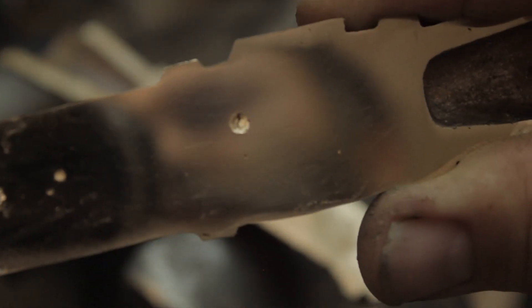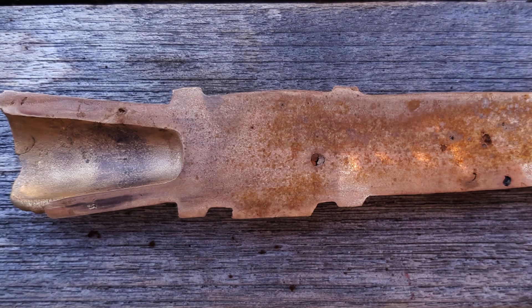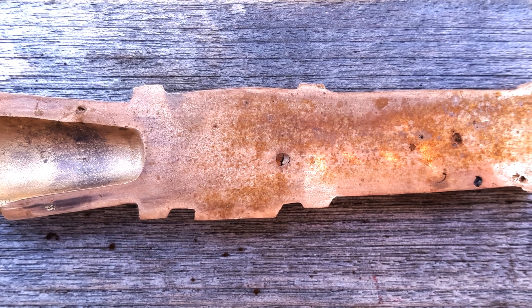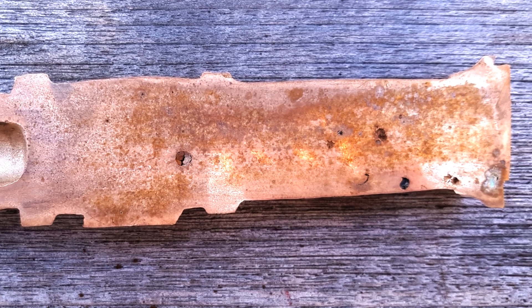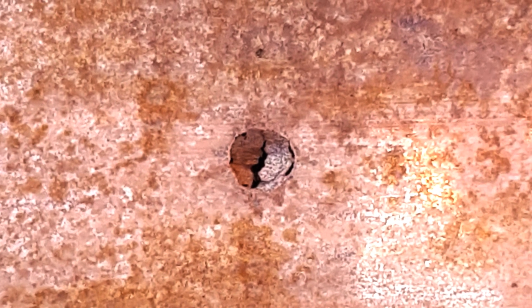Here you can see how well or how bad it is polished. Let's focus on the surface and then on the mirror image - we can sort of make out a reflection. If we look closely at the section, the folds are immediately visible. What are they? Are they gas bubbles or cavities? And what are cavities in terms of foundry? Looking closely at the internal surfaces of this fold, we see that they are rough. This points in the direction of a cavity.